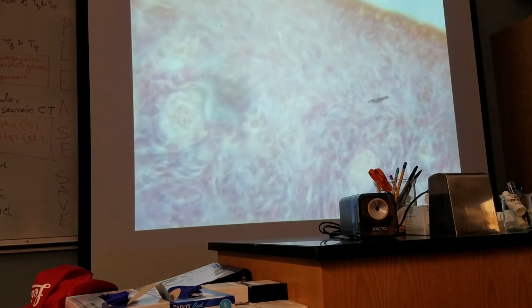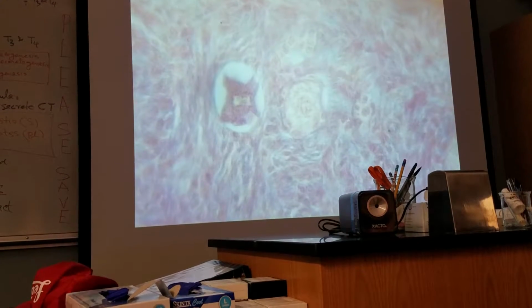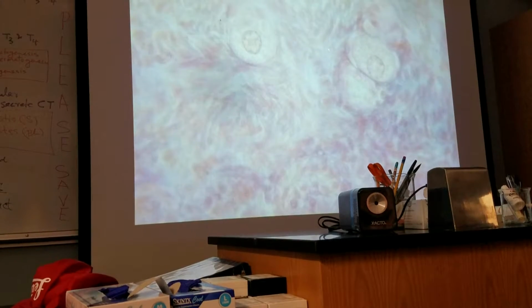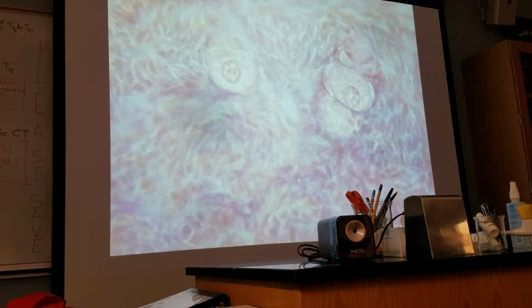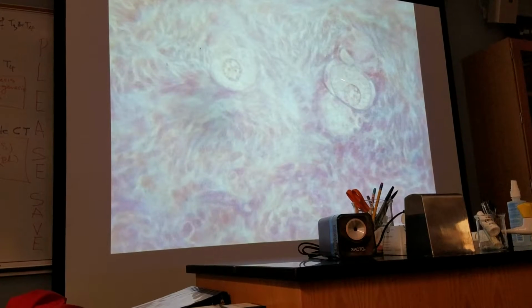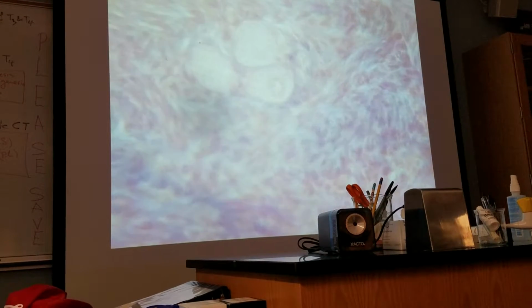I'll go to this, that is a primordial follicle. Still in search of a good primordial, these are primordial follicles still. And if you try to find these, the follicular cell, primary oocyte, I'll go to a perfect example.